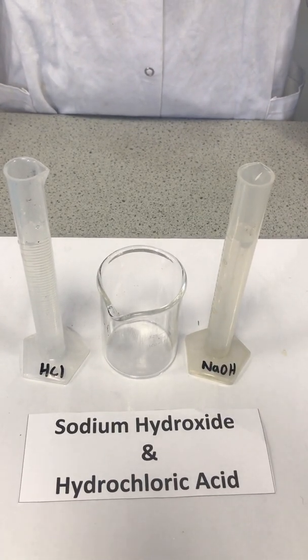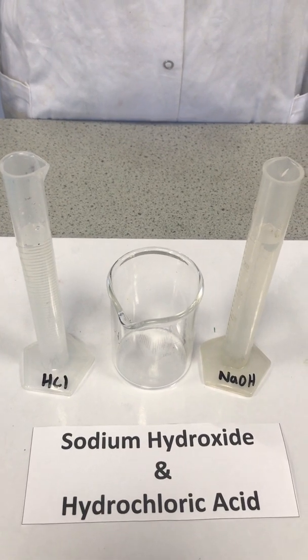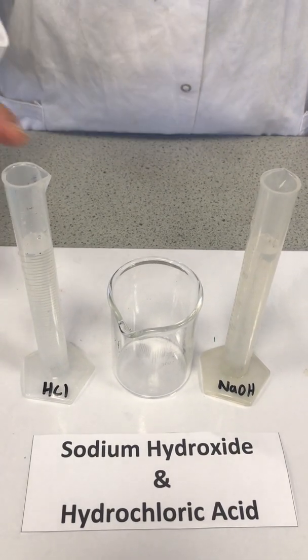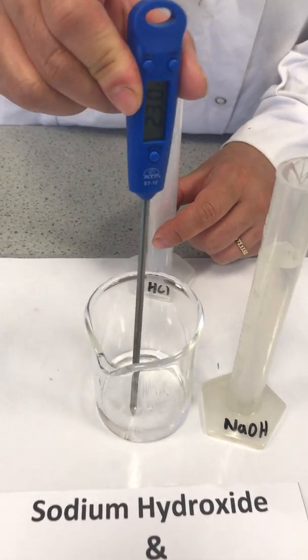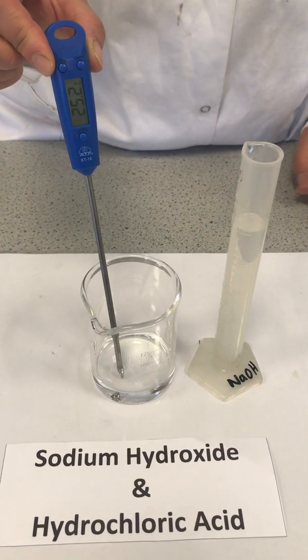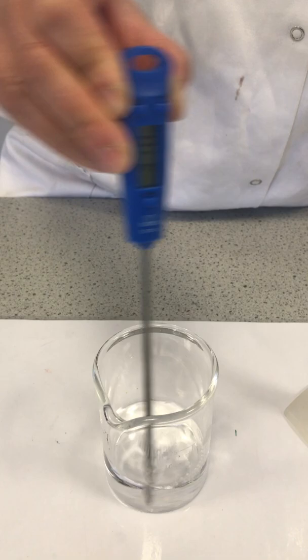Experiment 5. Reaction between sodium hydroxide solution and hydrochloric acid. Now we measure 25 ml of hydrochloric acid in a measuring cylinder and 25 ml of sodium hydroxide solution in a measuring cylinder. We pour hydrochloric acid inside the beaker and take the temperature. Now we add sodium hydroxide solution into the beaker of hydrochloric acid and stir the solution for a few seconds.